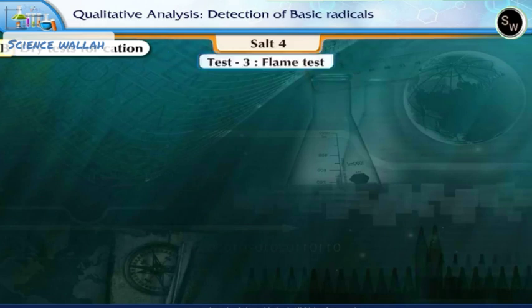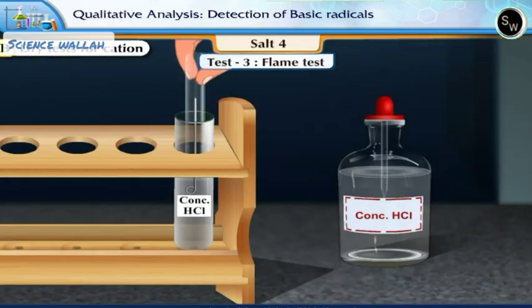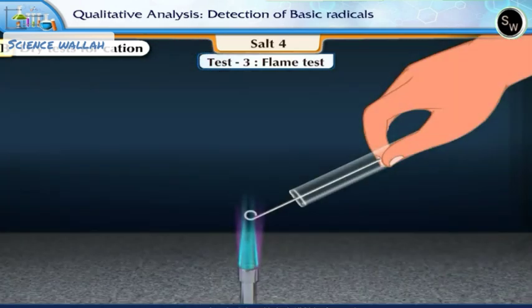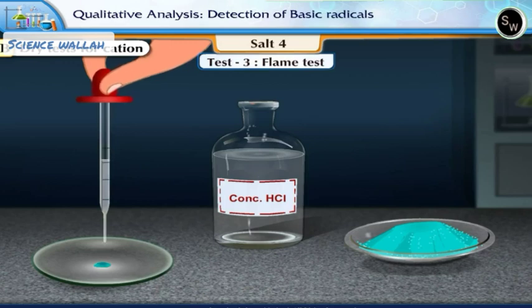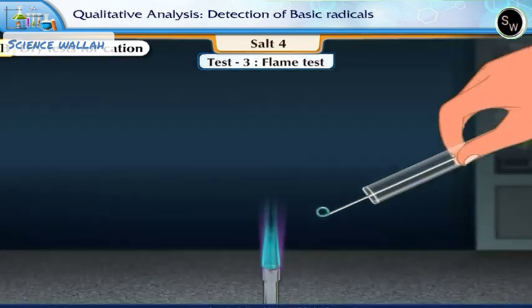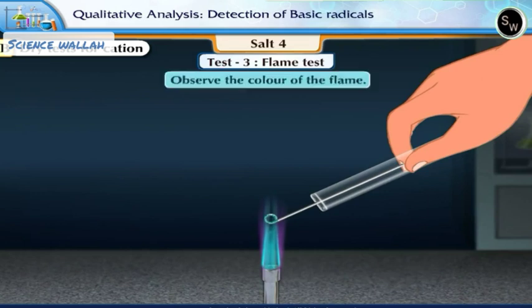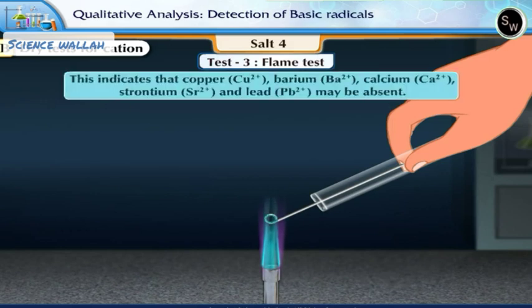Test 3: Flame Test. First, we shall clean the platinum wire. Dip the platinum wire in concentrated hydrochloric acid, then heat the wire in a slow oxidizing flame. Take a pinch of the given salt and add a few drops of concentrated hydrochloric acid to moisten it. Dip the clean platinum wire in it and hold it in the outer part of the oxidizing flame. Observe the color of the flame. There is no distinct color to the flame. This indicates that copper, barium, calcium, strontium and lead may be absent.